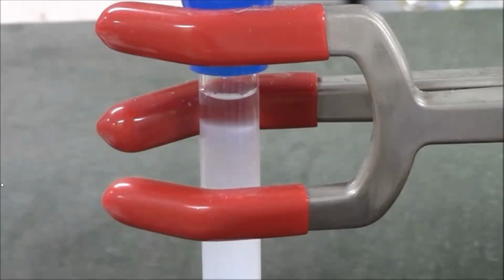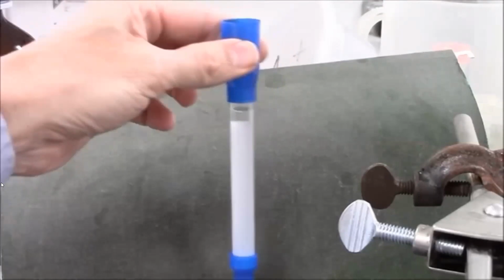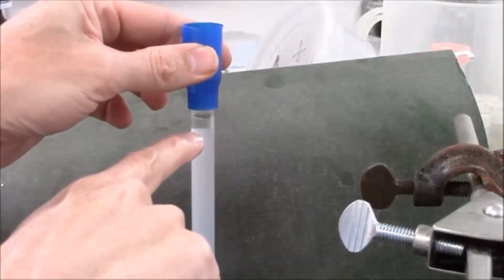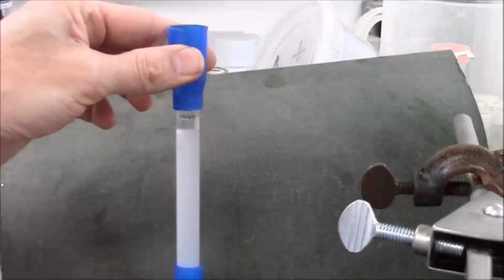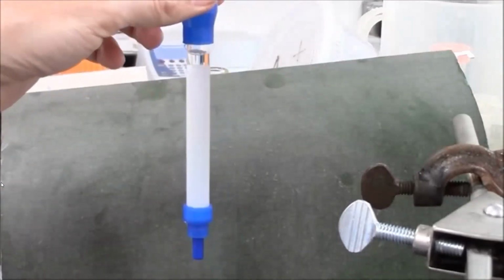I'll add a little more buffer so that it doesn't run dry at the top. So I'm gently adding a little buffer to the top. This looks great. You can see the gel bed is fully settled here. There's a little bit of buffer on the top. I've capped the bottom right now to keep it from going dry.